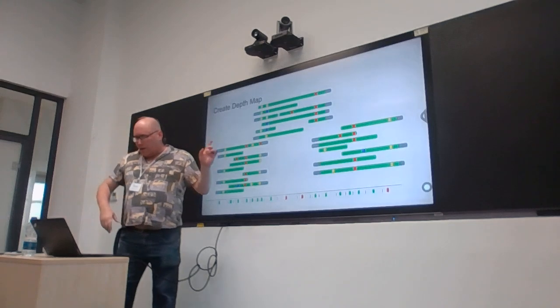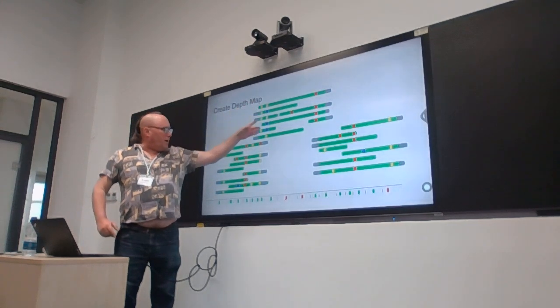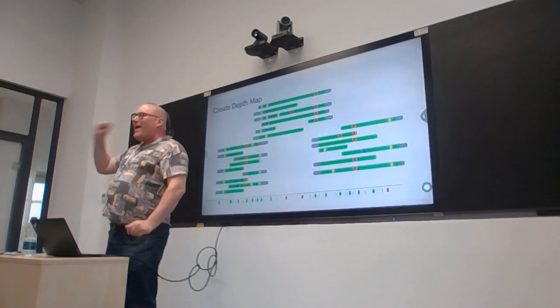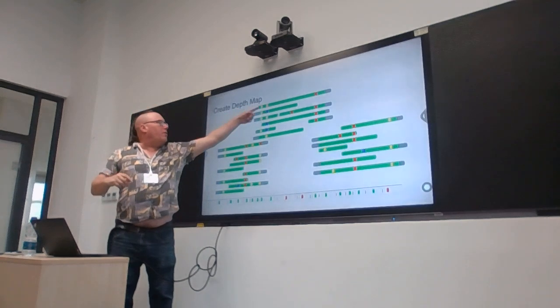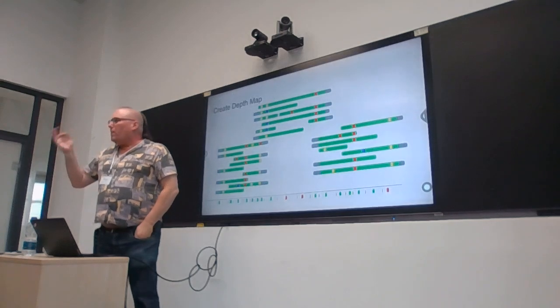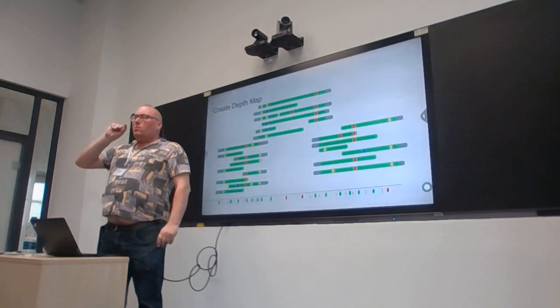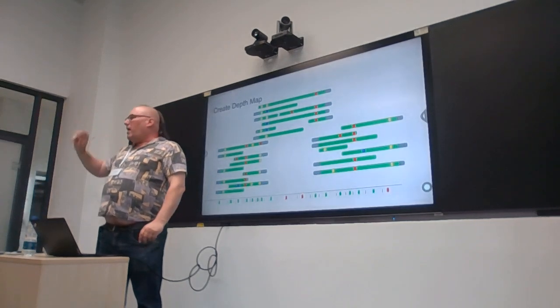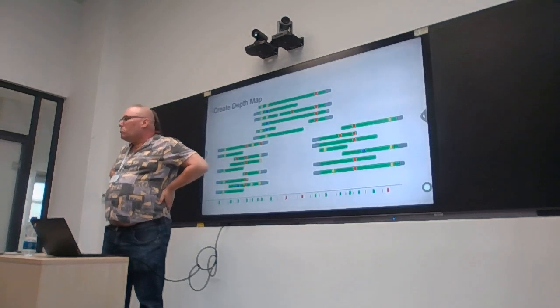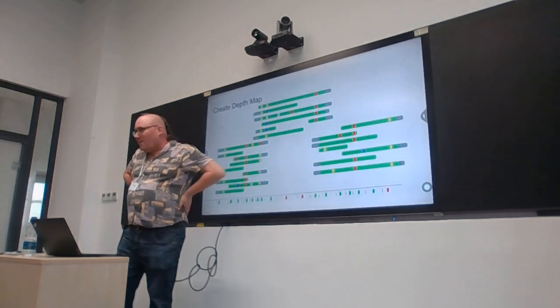But just before I get off this thing, I want to talk about one more thing. So I said that this could be caused by a mixed infection, okay? What is the more likely cause to have a mixed signal here? More likely than mixed infection. What is the most likely reason to see a mixture of maybe 20% one allele, 80% the other allele? Something much more human.